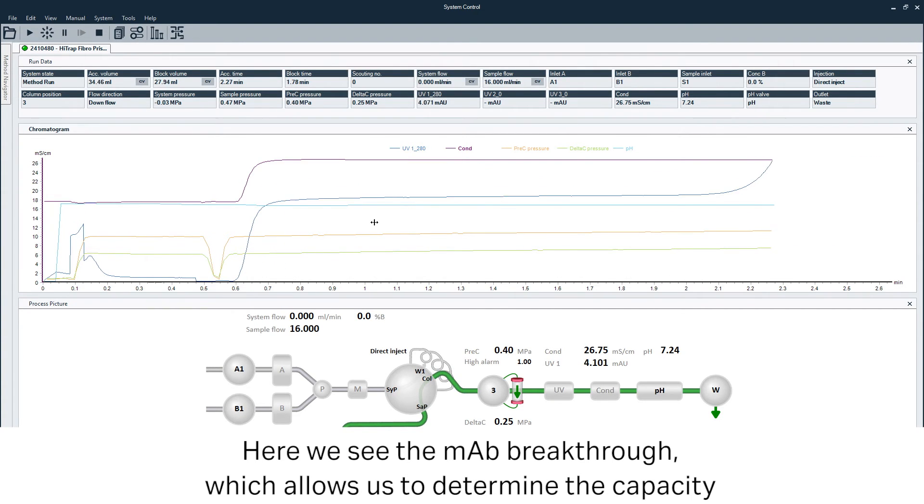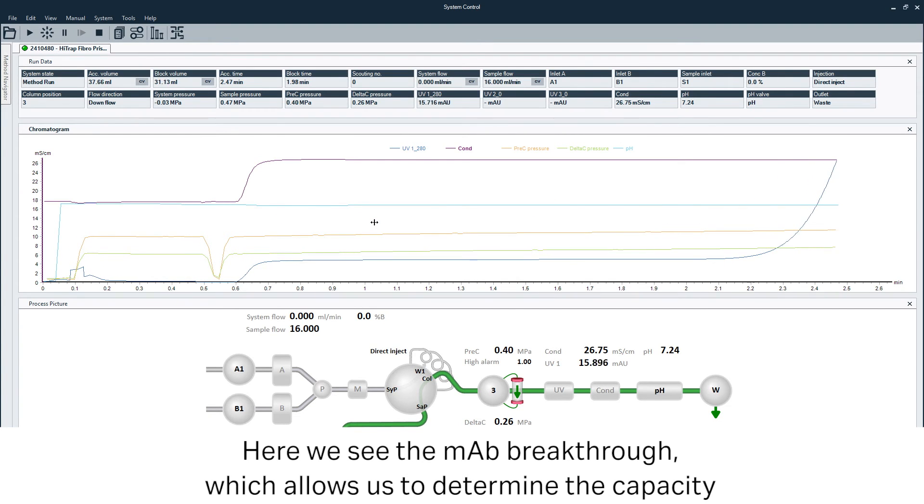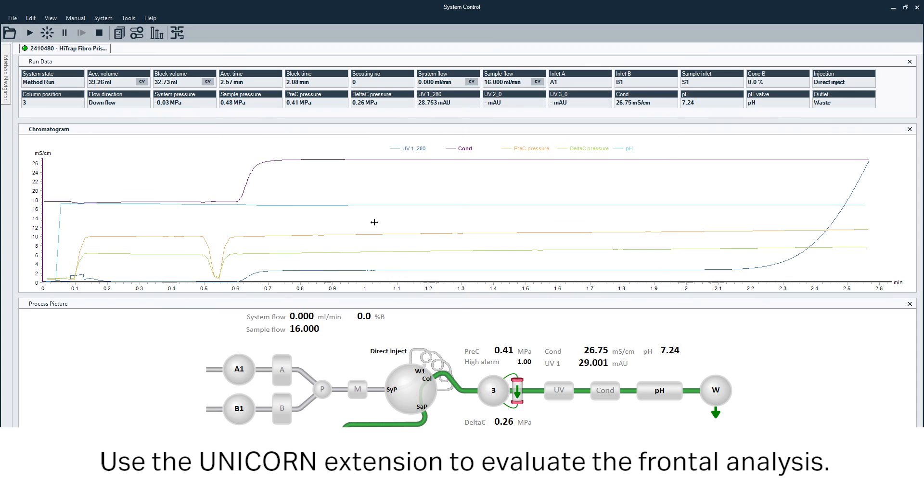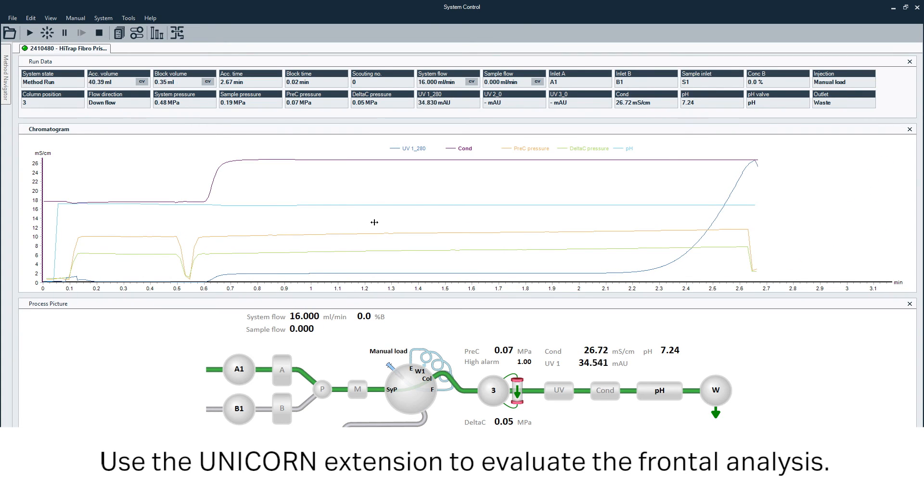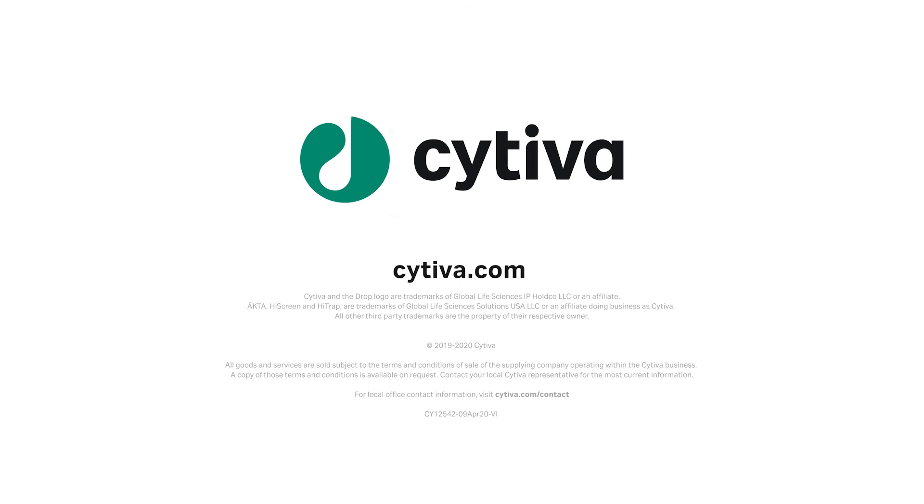Here we see the monoclonal antibody breakthrough, which allows us to determine the capacity.